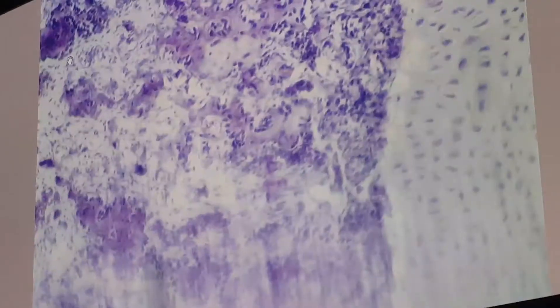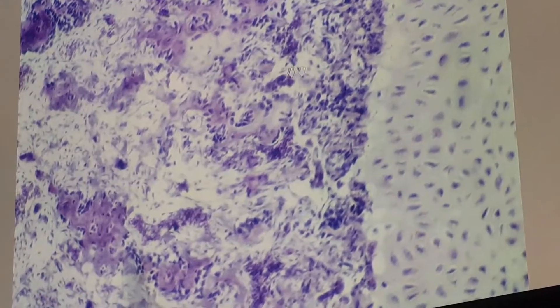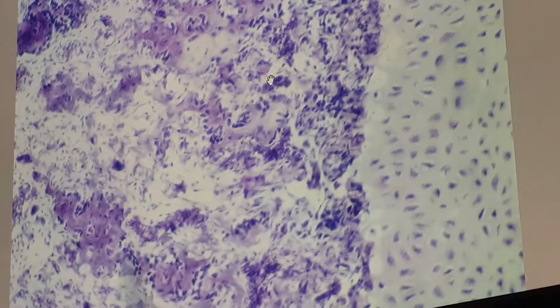To summarize: the first zone has only chondrocytes without morphological changes; the second is the proliferative zone with columns of stacked cells; the third is the hypertrophic zone with large chondrocytes full of glycogen; the fourth zone shows death of chondrocytes and calcification of the matrix septa; and the last is the ossification zone.